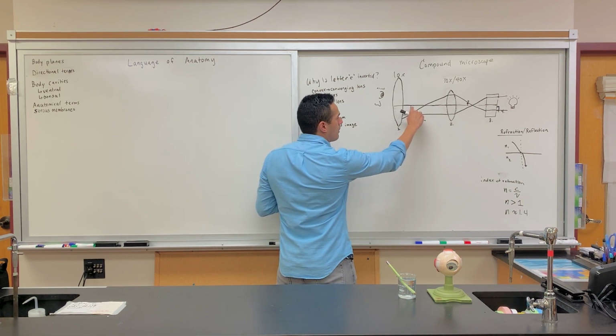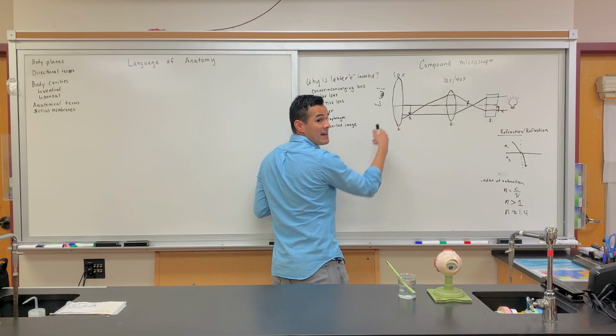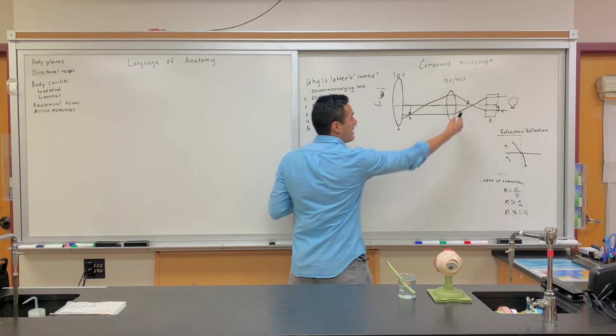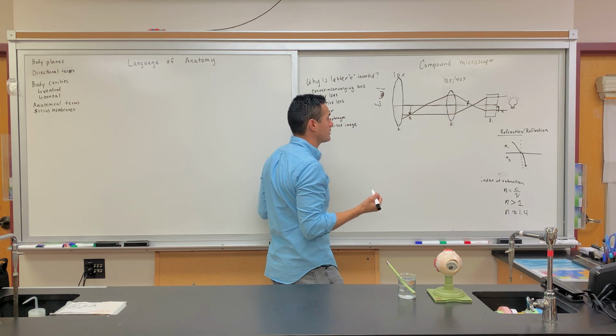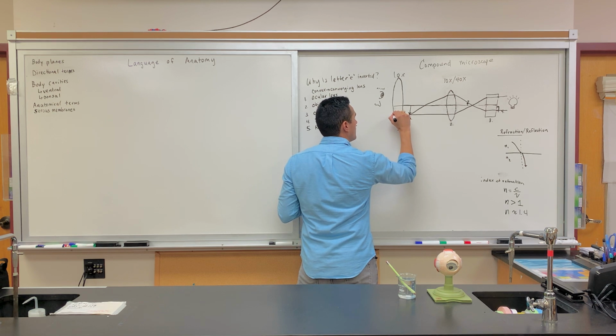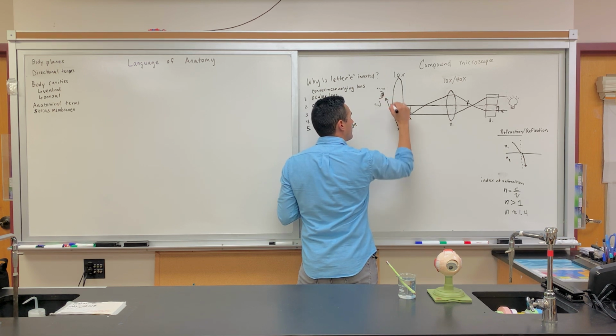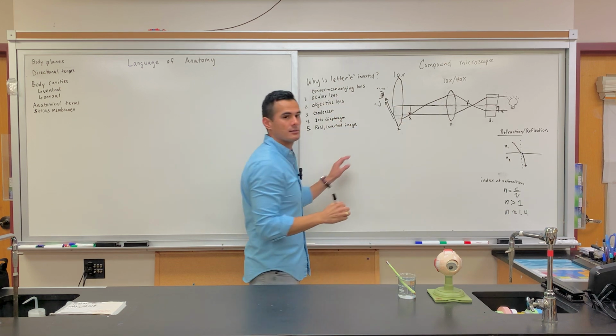And so once the light rays converge, they're going to continue, refraction is going to happen again, right? Because it happened once at the objective lens, now it's going to happen at the ocular lens. So once it passes through this medium, it'll go up to the eyeball. It'll go up to the eyeball. See, the light ray is refracting.